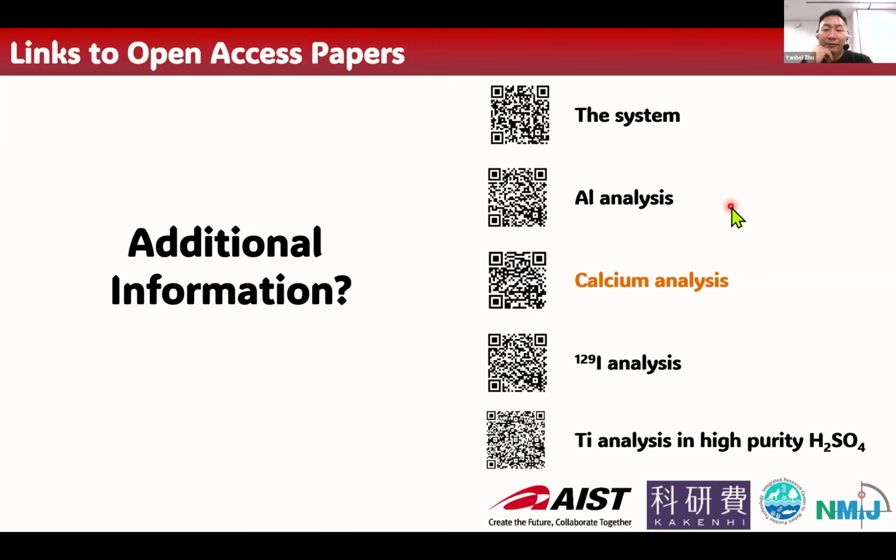But another question is, if we encounter very complex problems, such as a reaction in progress, how can we use ICP for the signal attribution to detailed chemical species? I think the quantitative measurement of the signals is sometimes difficult. Do you have any other ideas?